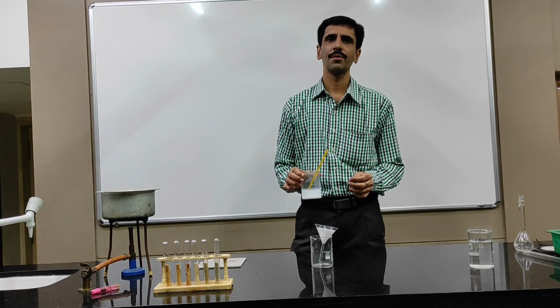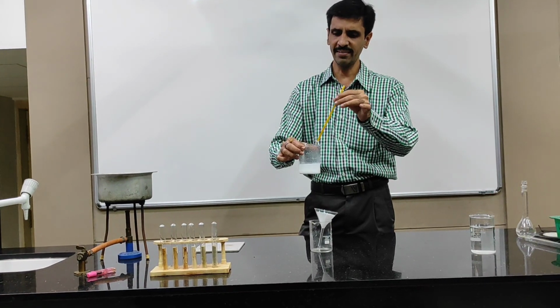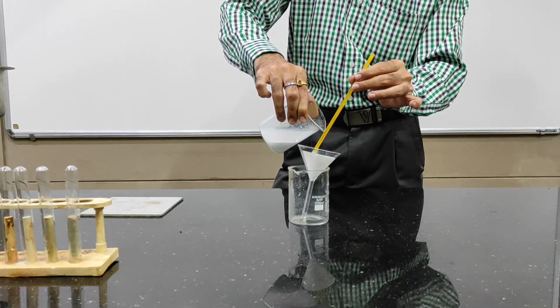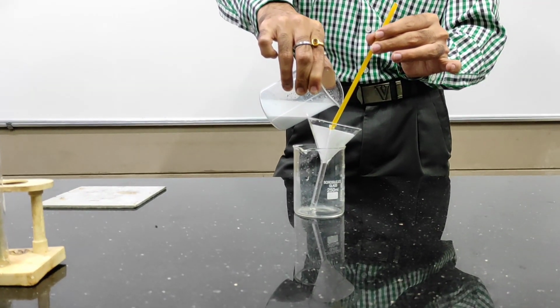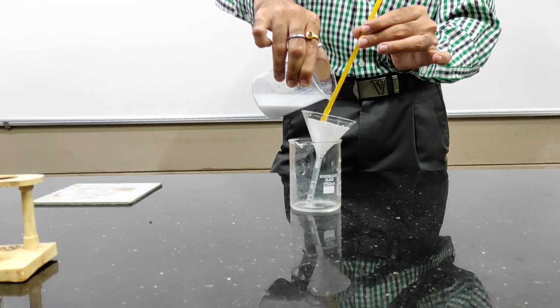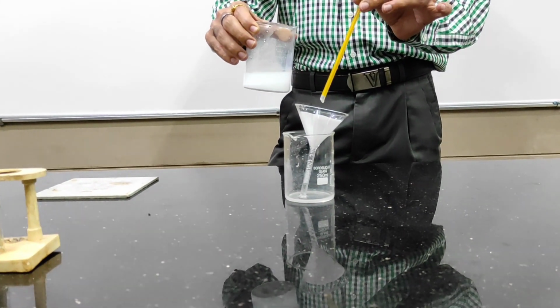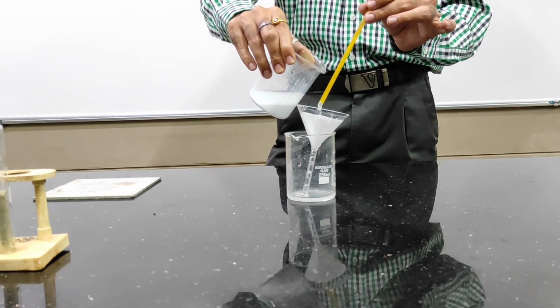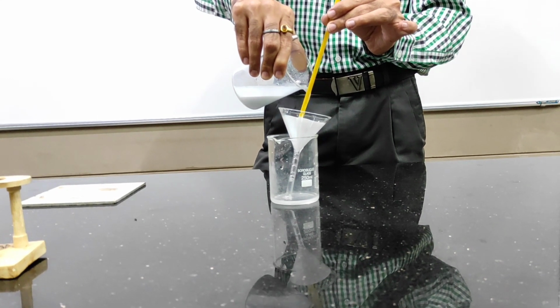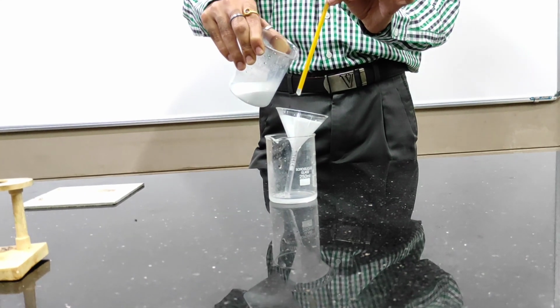Okay, so now this is sufficiently cool. First of all, as much as possible, we'll try to take the supernatant solution. So the filtration process is going to be fast enough. It's a clear solution, so it speeds up the process of filtration.